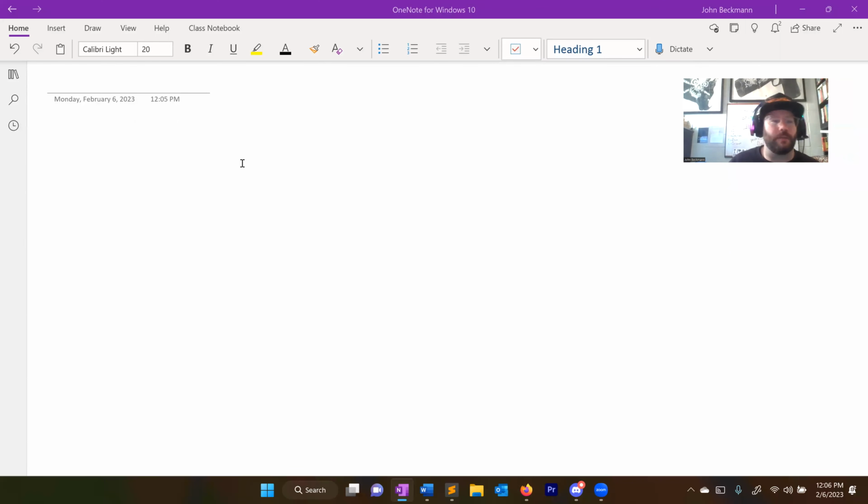I had received some requests to clarify what it means to clone in frame. I have a whole video on what it means precisely to clone in frame, but I kept getting comment after comment that was, well, you didn't actually show us how to do it. You didn't actually show us how to clone in frame.